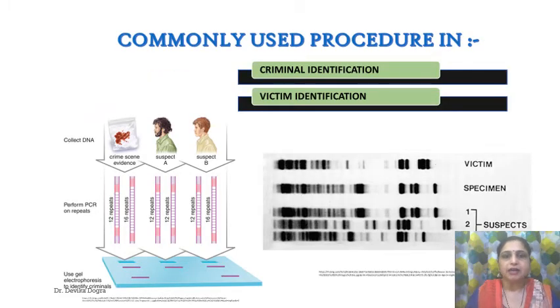In this slide, I wanted to bring your attention to the characterization and the identification of the victims and the human remains from the mass disaster by Southern blotting technique. Even a certain degree of DNA degradation was likely to be neglected by the analysis of small polymorphic regions known as STRs or short tandem repeats, which are widely distributed all around the genome.